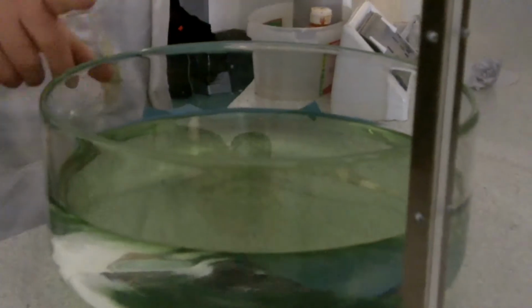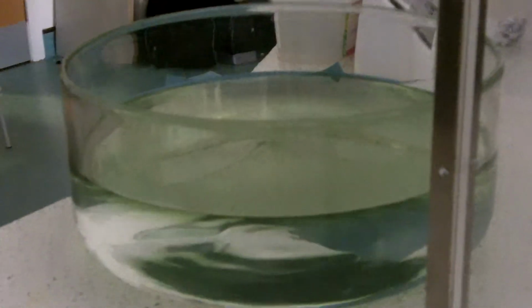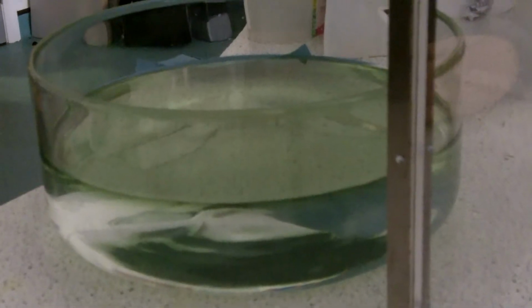What I've just done with the water is I put an indicator in. Those who were in my class today would have known that this is universal indicator. It changes colour with different pH, acidic and alkaline. It's green, because that's neutral. So green is neutral, for this indicator, yes. Alright, so I'm going to remove the oil from it.